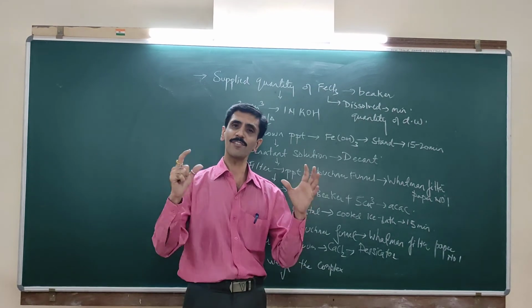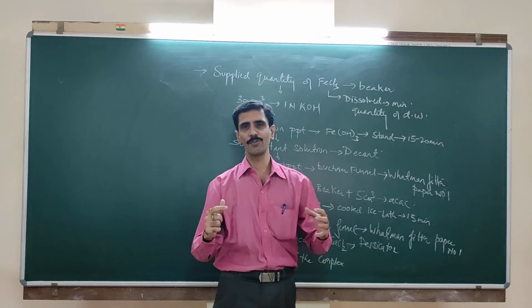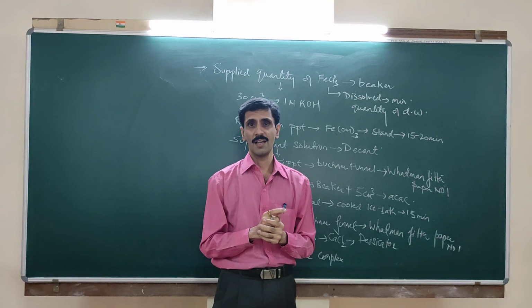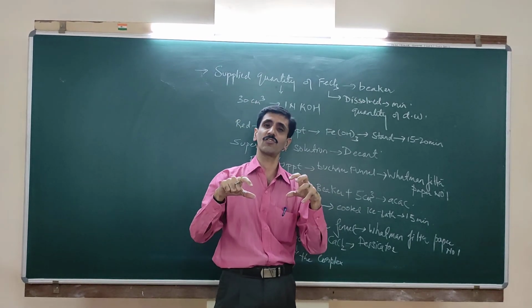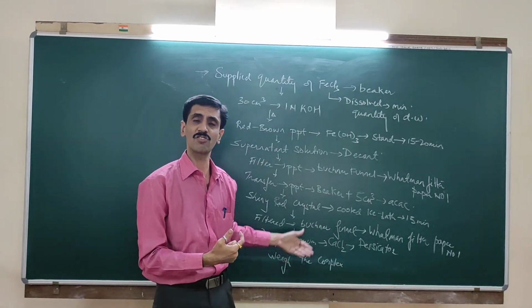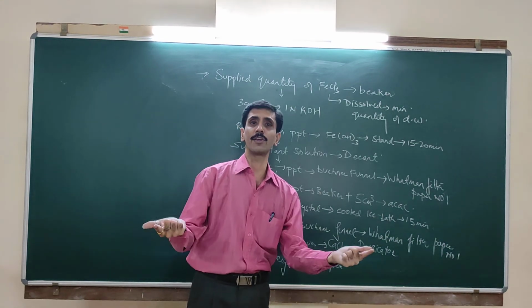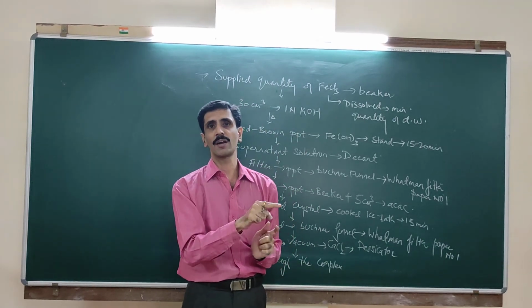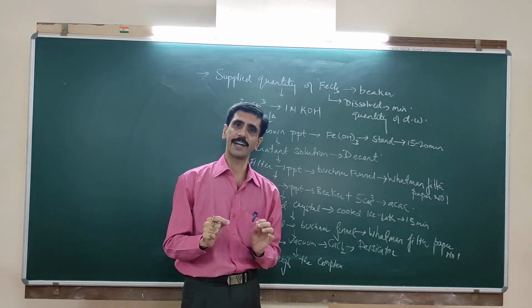So this is it, my dear friends. In this first part of the video, I have tried to give you the theoretical approach of the synthesis of this complex. What exactly the complex is all about, what is the application of this complex, why we are preparing it, and then I have told you the steps involved in the preparation of this. In the next part of the video, I will actually demonstrate the procedure of synthesis of this complex. I hope everyone has understood up to this very well.